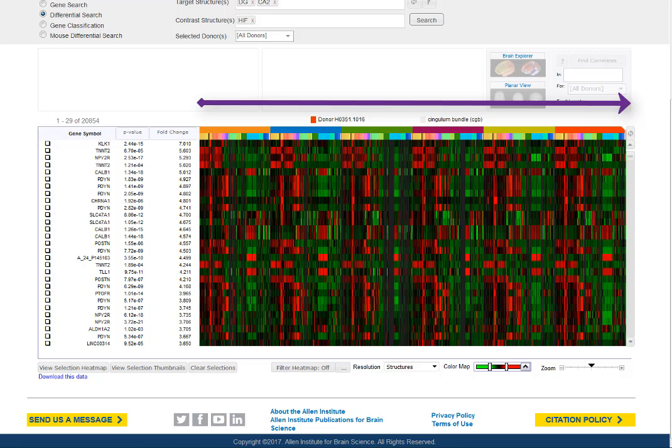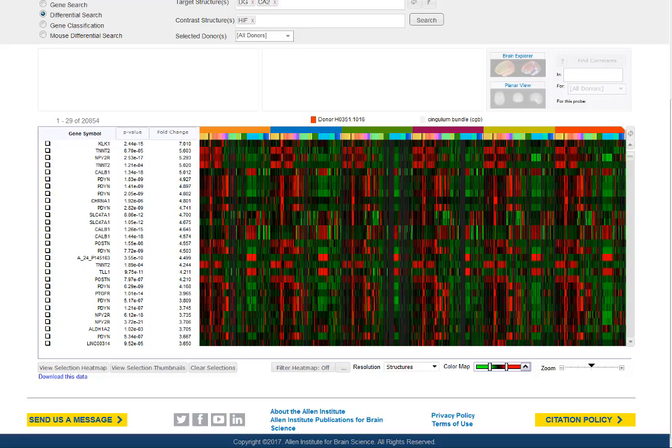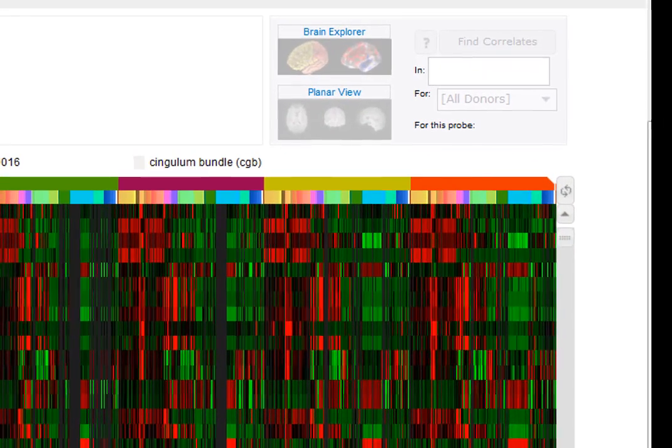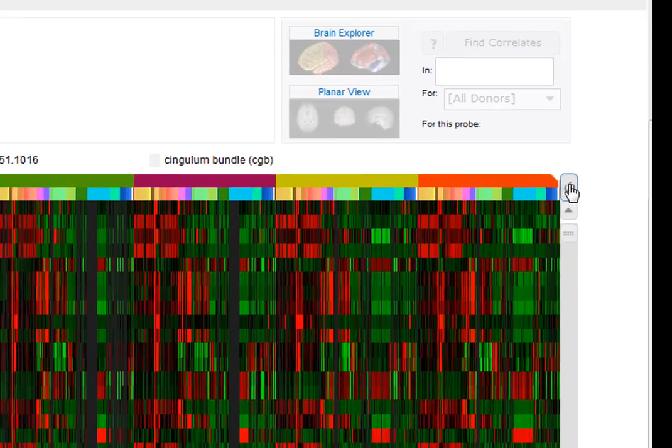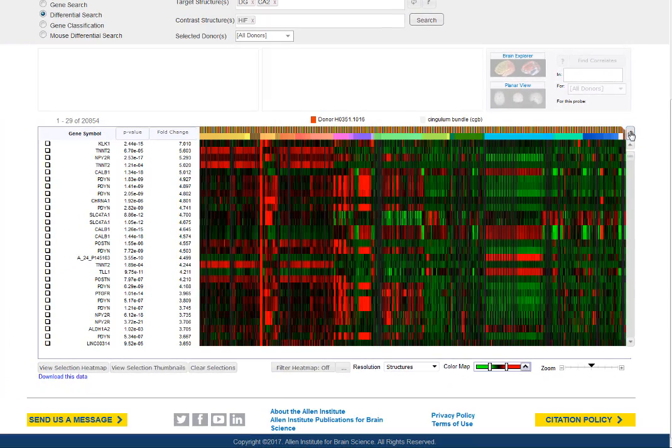The second row indicates the structure. To change the initial sort parameter between donor and structure, click the toggle button in the top right-hand corner. You'll notice that the donors are now interleaved and gene expression patterns start to emerge by structure.